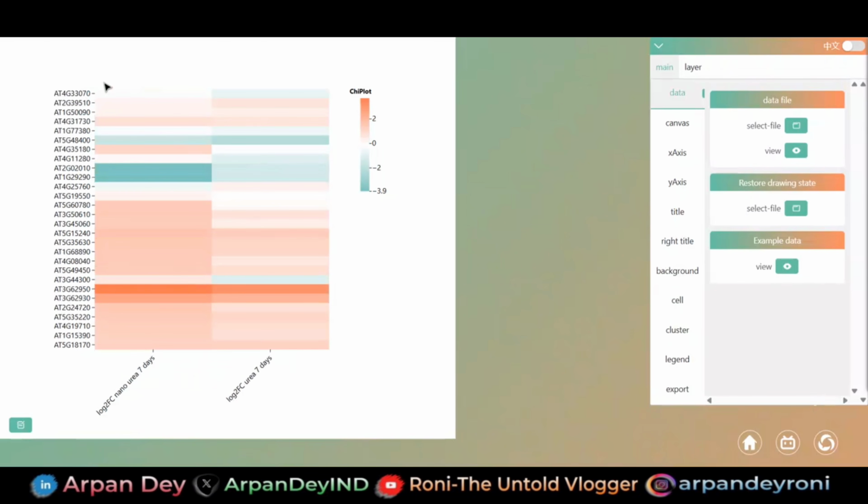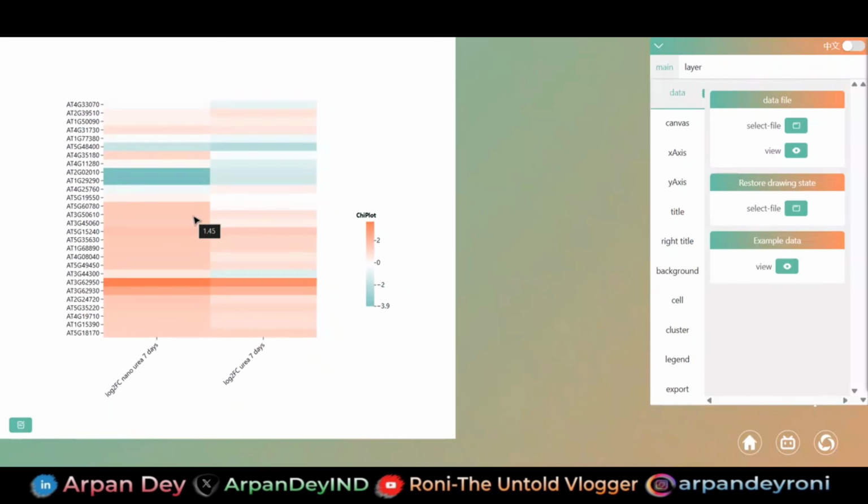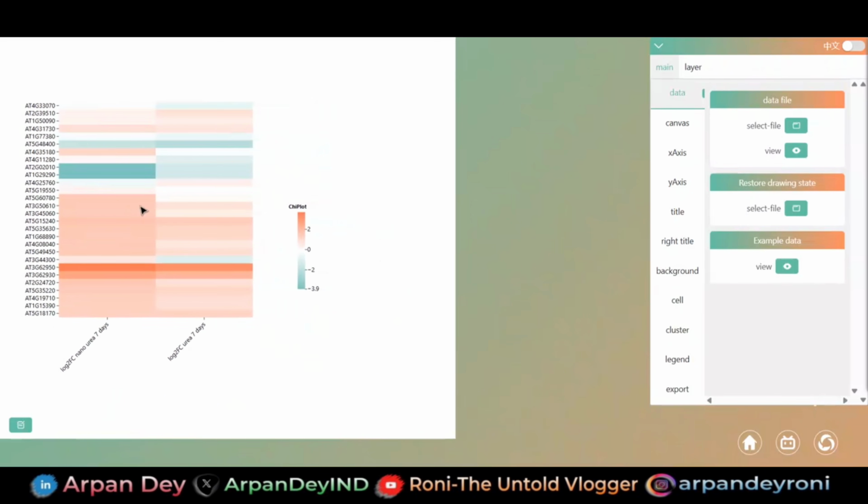Here you can see the previous one already got changed by default, and my gene list of interest is here, and you can also see the nanourea versus urea treatment. These are all the gene IDs. Also you can move this bar here and there, whatever you want. Let's say I'm keeping it here, and you can also move it this way. You can also zoom in or zoom out. Let's say I am keeping it here.